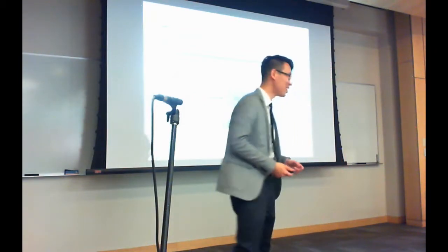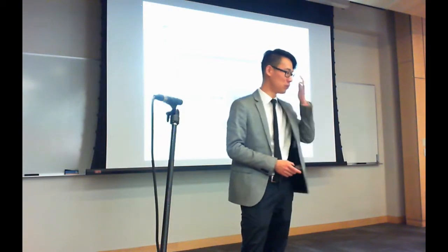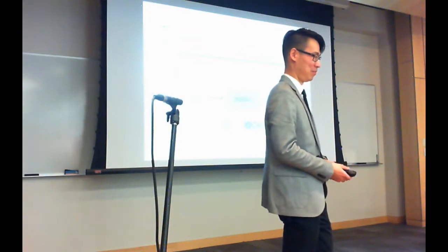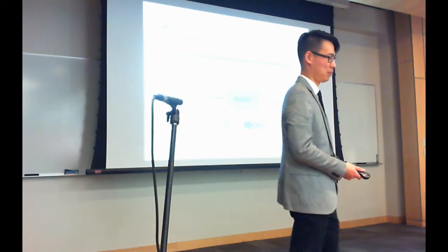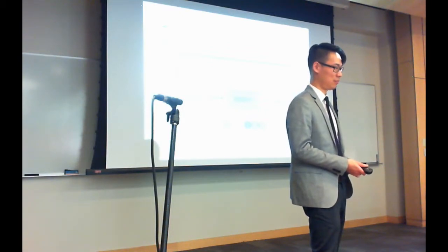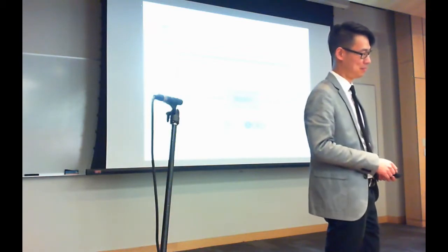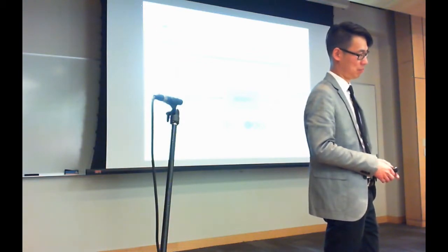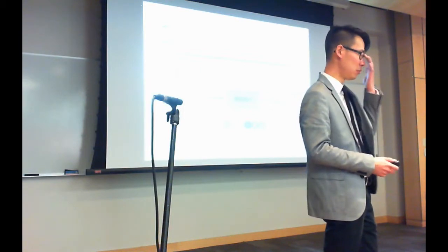I would actually add that you can't get 0% FDR. You can get an estimation error. Yes, of course. You just don't have enough decoys to know how much larger than 0 it is. But that's an estimation error. If people proudly publish a list of identifications with 1% FDR, somebody can equally proudly publish a list of identifications with 0% FDR. But the error is not true, because the variance of the two estimates is not the same. With 1%, you have an approximation from the number of decoys, but at 0, there are no decoys, there's no estimate, right? So your error is actually going to be worse if you claim it's 0.